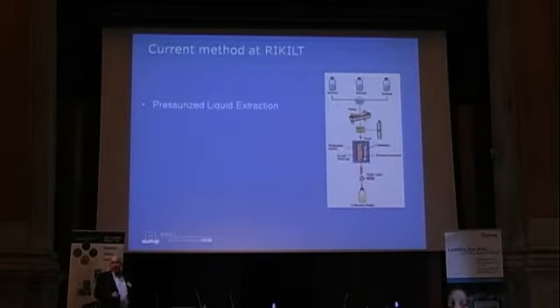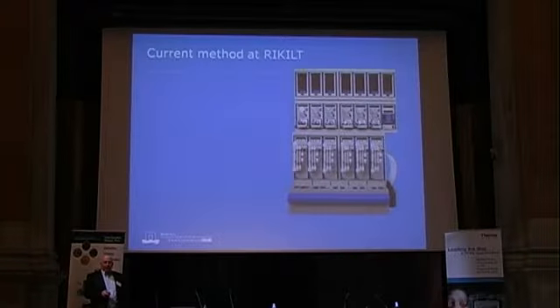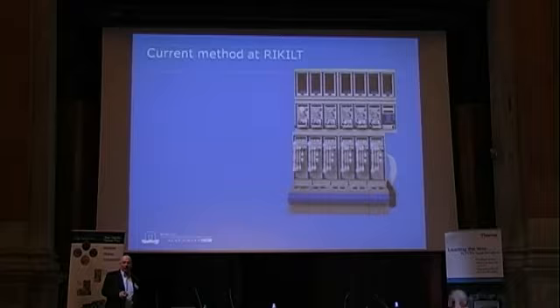The next part is the power prep, and nowadays we have 9 modules, so we can run not 9 samples in every series, but we run 7 samples, because I would like to have in every series a procedure blank and a certified reference sample, or a sample which has been analyzed in the past, just for quality assurance. And we use this setup for the purification of the extract, of course.